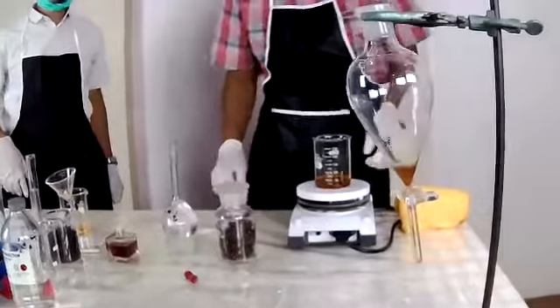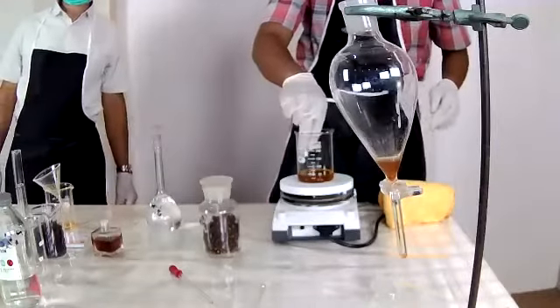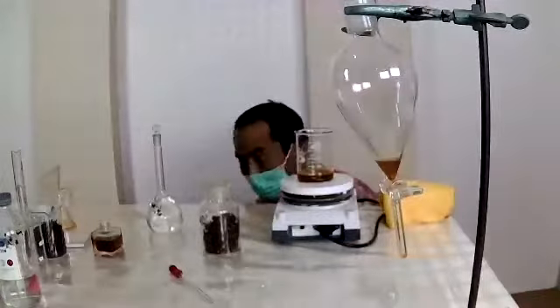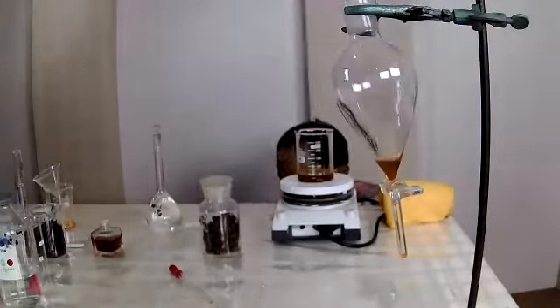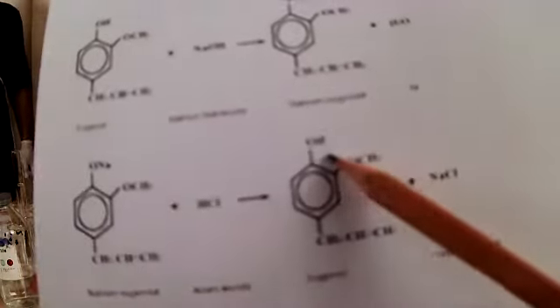We can stir this. We're going to use hydrochloric acid and convert this back to eugenol.